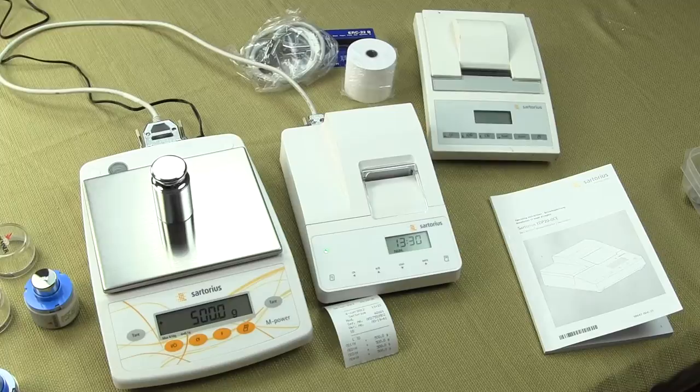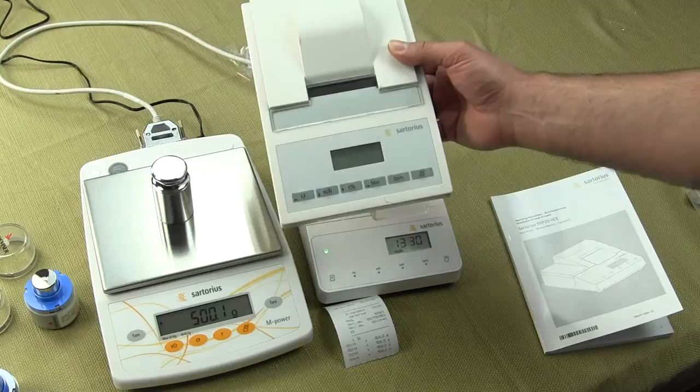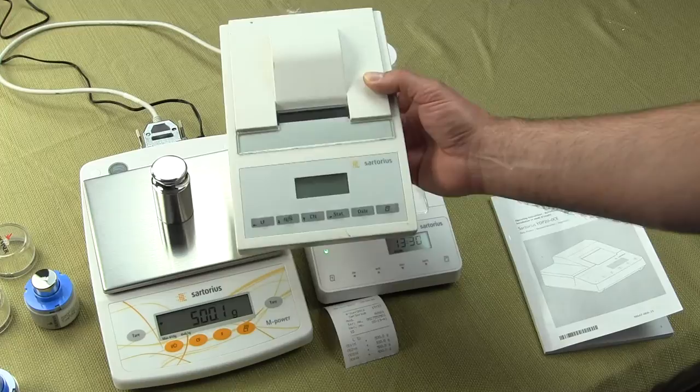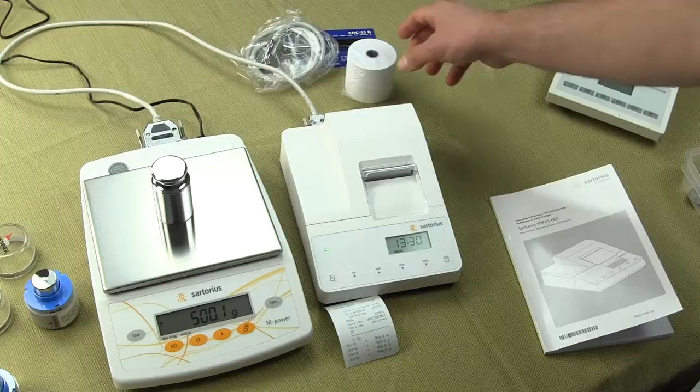Welcome to Precision Weigh-In Balances. In this video, we'd like to show you the Sartorius YDP-20 OCE printer. This printer replaces Sartorius' prior model, which was the YDP-03 OCE. So this is the older printer, no longer in production. And the new printer is right here — this is the Sartorius YDP-20 printer.